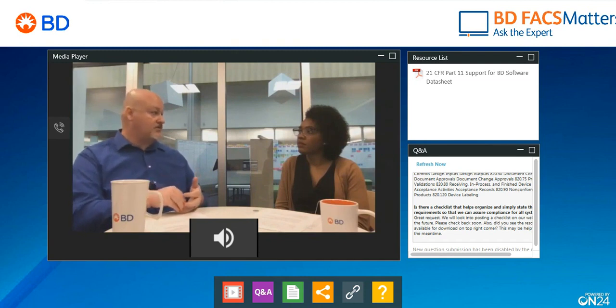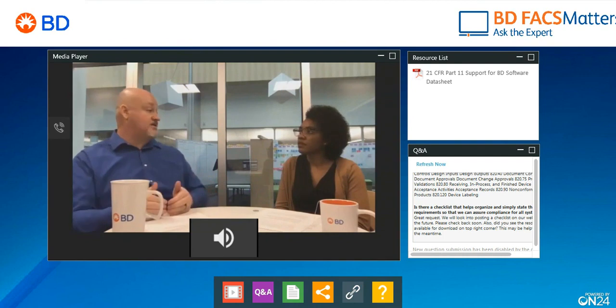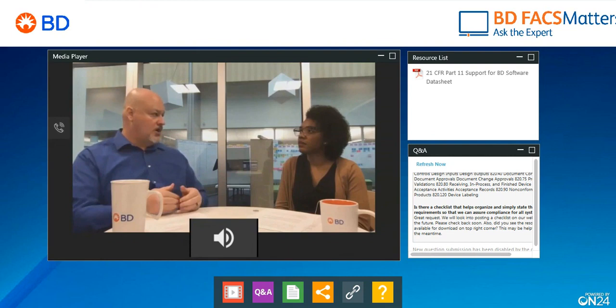how to handle, let's say if you lose your password, you can't remember it, and you have a number of login attempts and it fails. The FDA is not going to tell you how many login attempts are going to fail or what exactly those security procedures are going to be. They're going to let you determine what is best for your company.